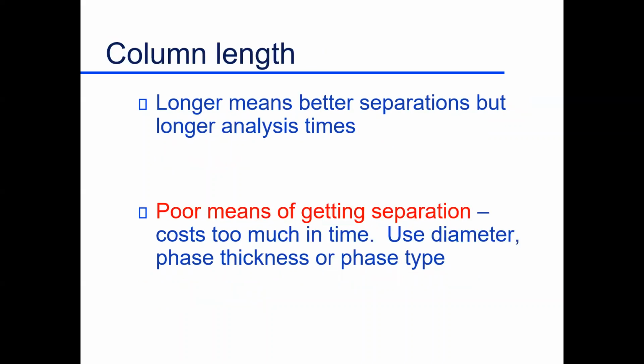And for that, we typically do the 0.25 microns. So we do 0.25 millimeter diameter. We do 0.25 micron, actually, film thickness. So really, really thin film. So that kind of takes care of why we pick columns the way we do. How long should it be?